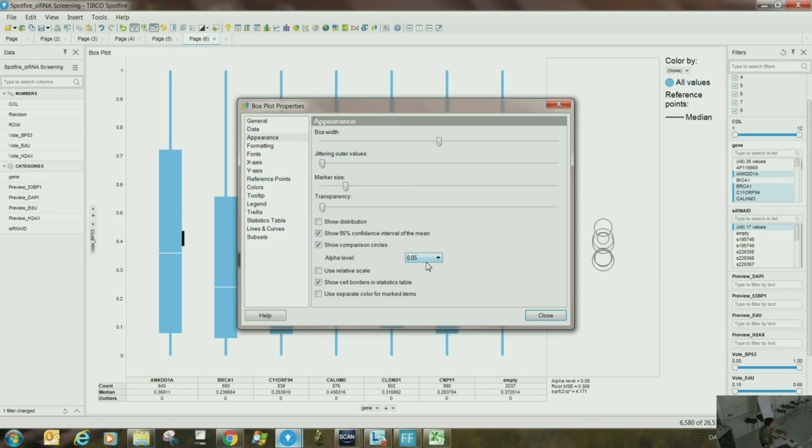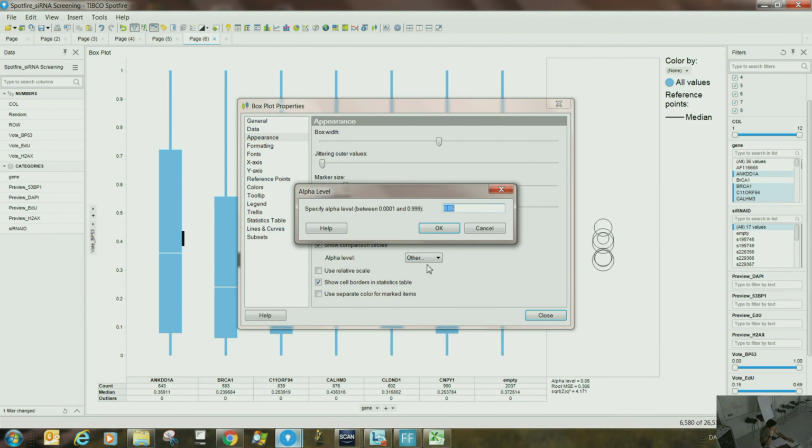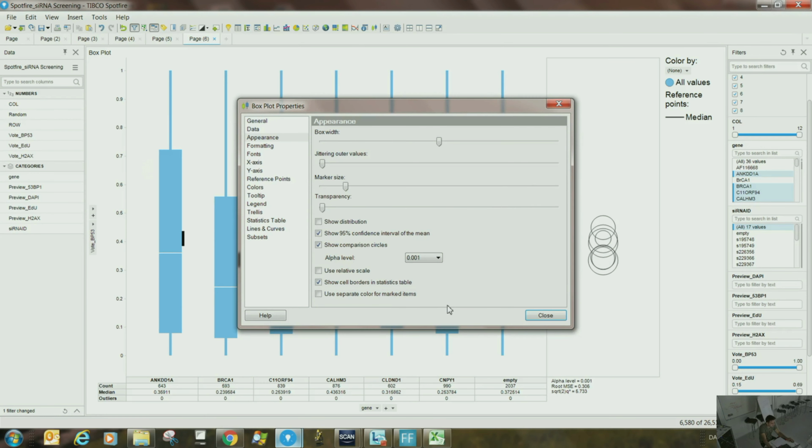Well, there is also debate on this these days, right? One has to reduce it to 0.001, from 0.05. But that you can change also here. So I would give, let's say, I would always go for 0.001. That's always what one should try. But then nothing is significant, right? Then in this case, you have to improve your sample size.